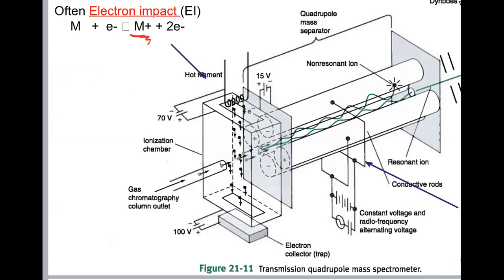Now that's required for mass spectrometry, because you do mass spectrometry on ions. You have to ionize things before you can measure them by mass spectrometry. And that's why, generally speaking, there are a large number of different sources. They all work in a different way, but you have to have an ion source. Electron impact is the most common for GCMS. There are a few others, but this is the most common. Now, what do we do with these ions after we make them in that region? Remember, we're making M+ ions there, okay? Now we can do the mass spectrometry.